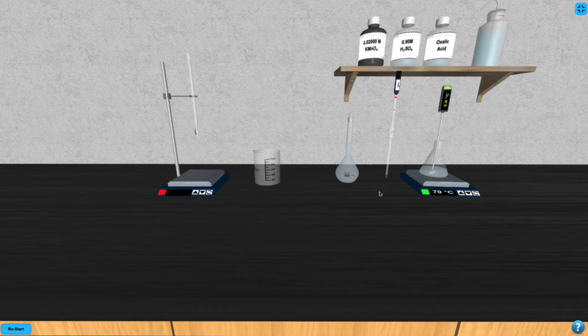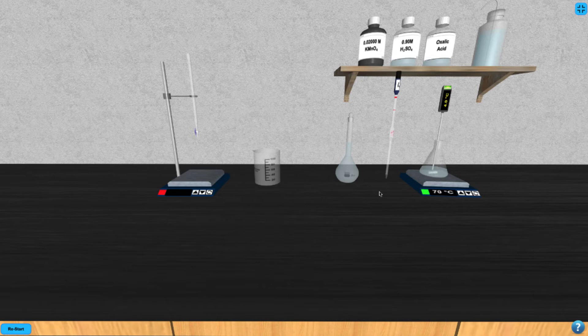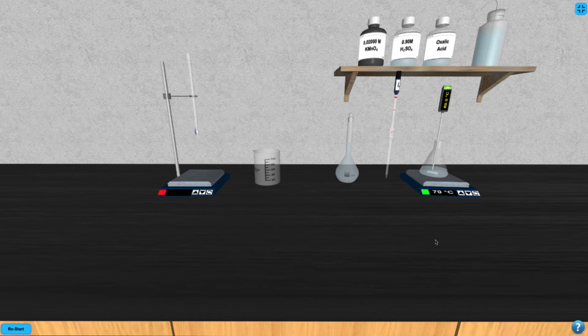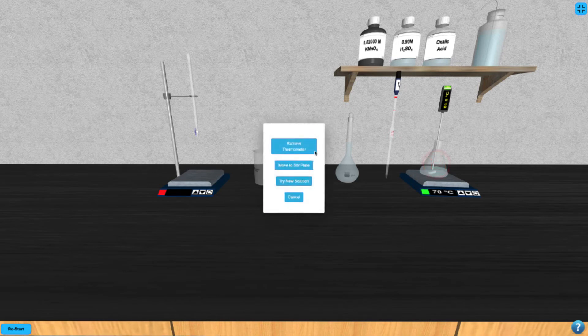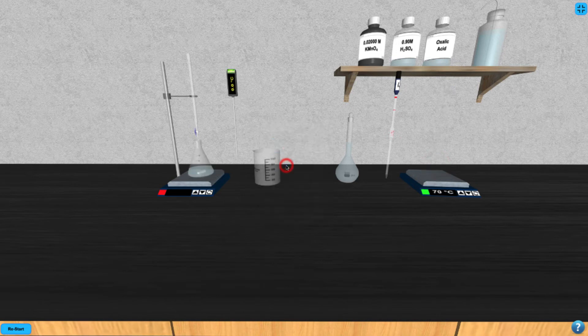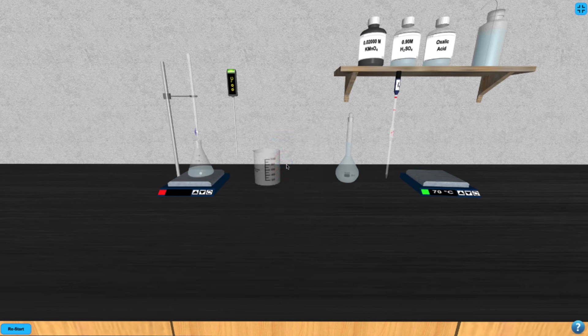Now watch the thermometer until the solution arrives at 60 degrees. Be careful not to overheat your solution or the titration will not work properly. Once your solution is heated properly, you can click on the Erlenmeyer to move it to the stir plate under the buret.